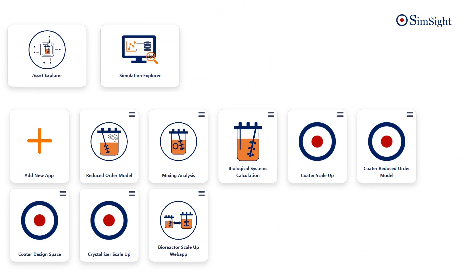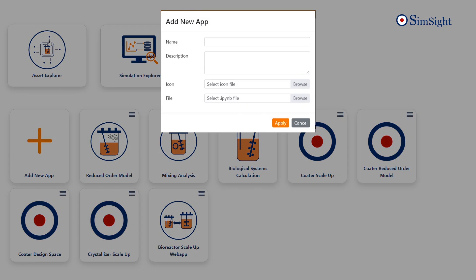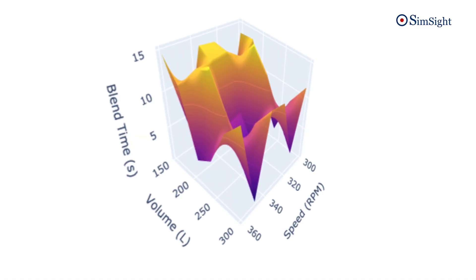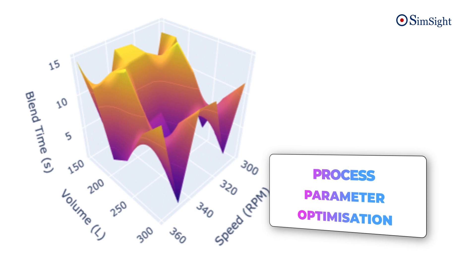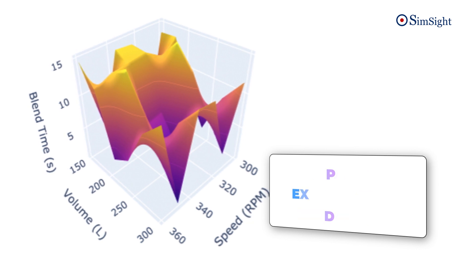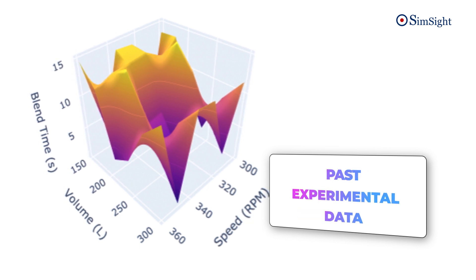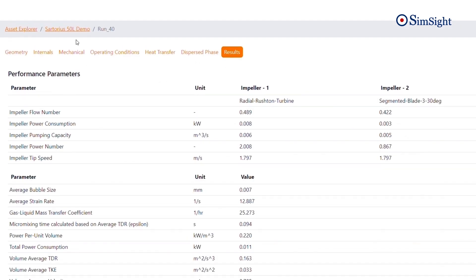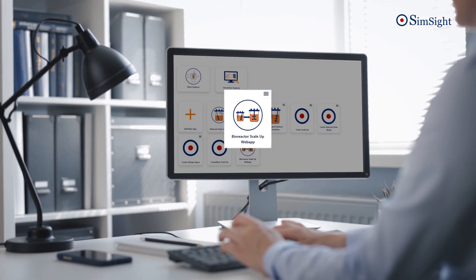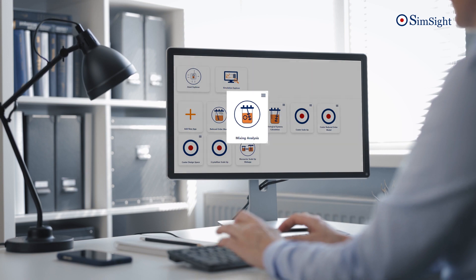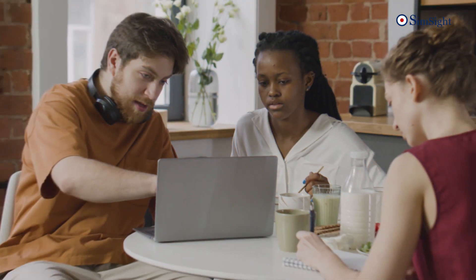SimSight's feature-rich app environment lets you build unique apps for your needs and use cases. It enables complete control over complex data analysis and process parameter optimization, and even allows uploading past experimental data for analysis or scaling up or down. It smartly interprets experimental, pilot plans, and commercial process data scientifically. The app environment is specifically designed to empower engineers and technologists to deploy process knowledge in the most efficient and effective way to satisfy their day-to-day work activities.